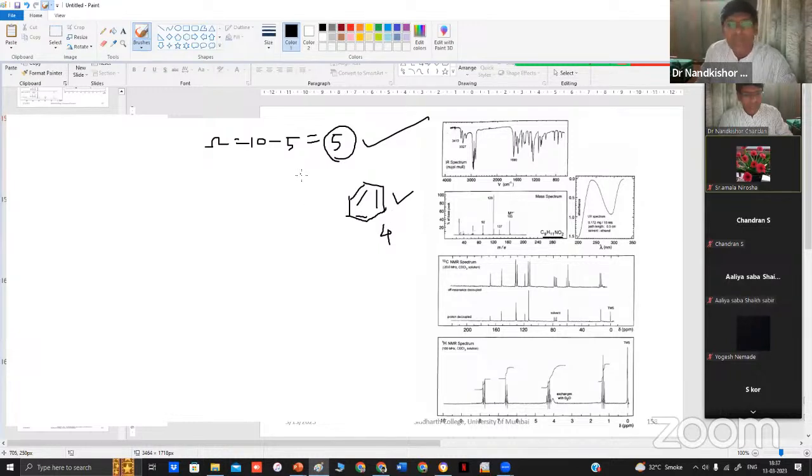Now this structure we have already discussed in the last lecture, but as such, the structural elucidation we did not comment on in a proper sense. That's why I chose this structure to comment again. From the molecular formula, it is very clear there are 5 double bonds present. And how have we justified those 5 double bonds? 4 from the aromatic ring, and 1 may be the olefinic double bond, or it may be the carbonyl double bond. So these are the comments.